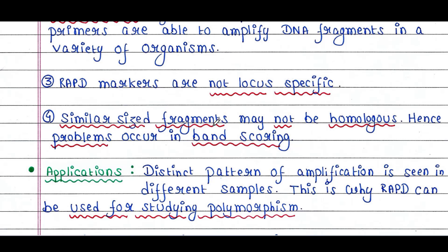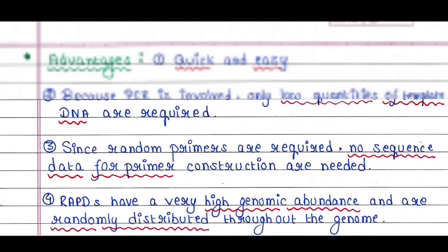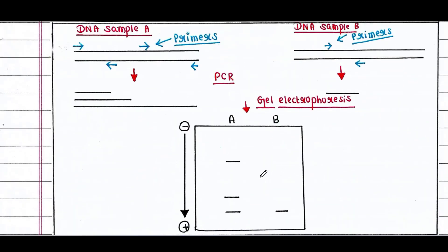Similar sized fragments may not be homologous. Hence, problems occur in band scoring. If you see this gel, you can find similar sized bands from both samples. This band and this band look similar, but these two are not homologous regions of DNA. This band represents this part, and this band represents this part, and these two are not the same. Hence, similar size doesn't indicate similar region.